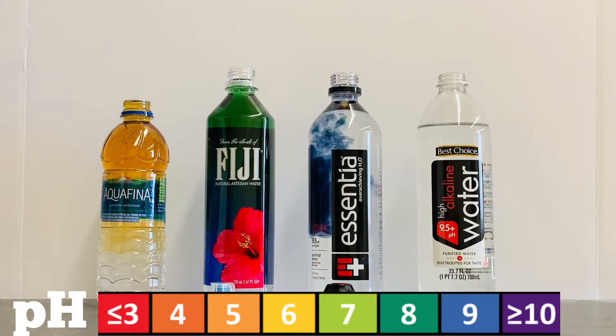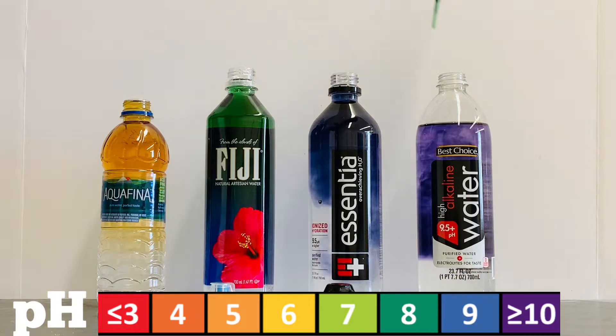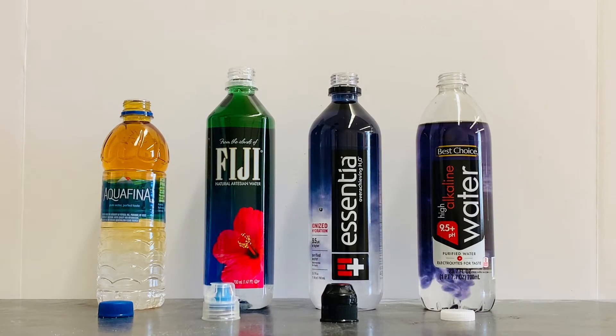In the Essential water, the indicator turned blue, indicating a pH of nine — Essence is fairly basic. Finally, the indicator turned a violet color in the generic alkaline water, meaning this water is pretty basic.